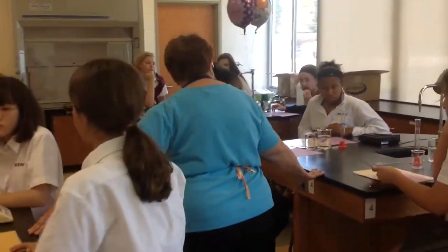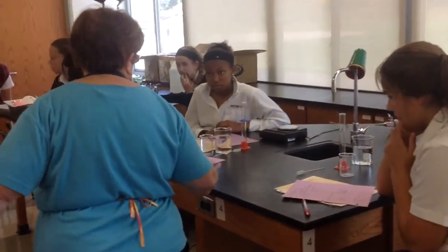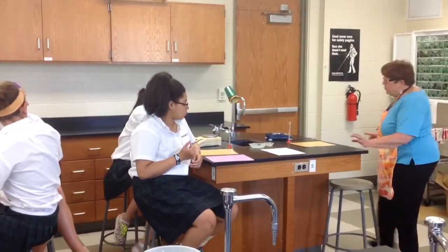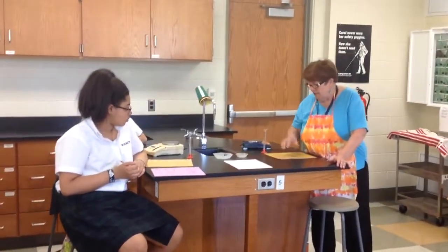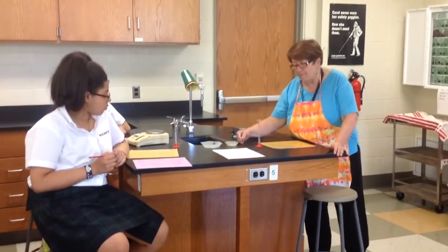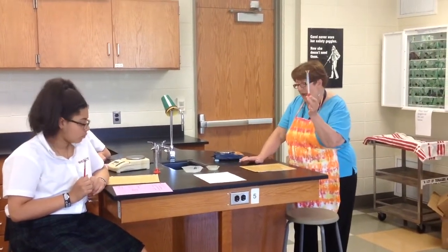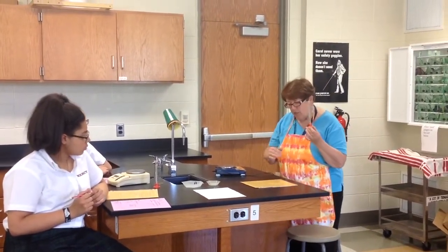All right, so that was station what? 3. 4. That was 3. All right. Then 4 is these 2 tables. So there can be 4 groups here at a time, and here you're going to be determining the density of a metal. You have a choice of metal A or B. Write down which one you're picking, and then you're going to take a cylinder, fill it about half full of tap water. So this is a 10 milliliter cylinder. Do I need exactly 5.00 milliliters? No, it says about half full. Then just write down what it actually is. Is it 4.85? Is it 5.1? Whatever. Write down what it actually is.